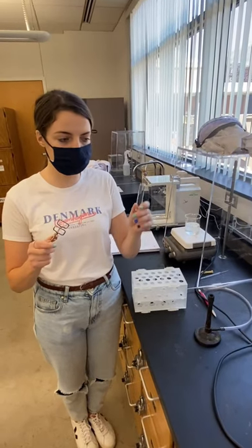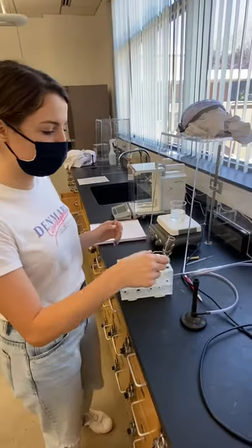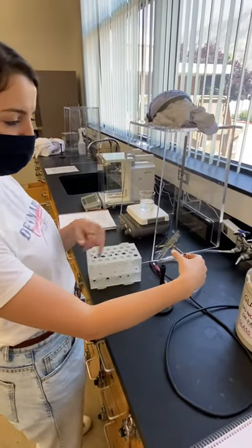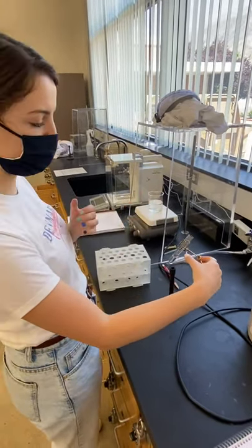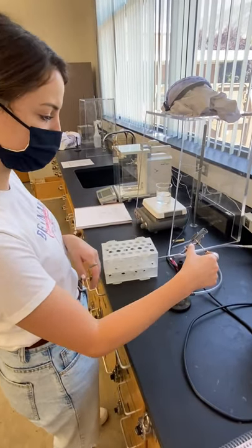When using a Bunsen burner, you're going to hold your cylinder with a clamp and then tilt it away from you in case chemicals spill up and don't hit you. You're going to want to move it around so it hits multiple parts of the liquid, not just one place.